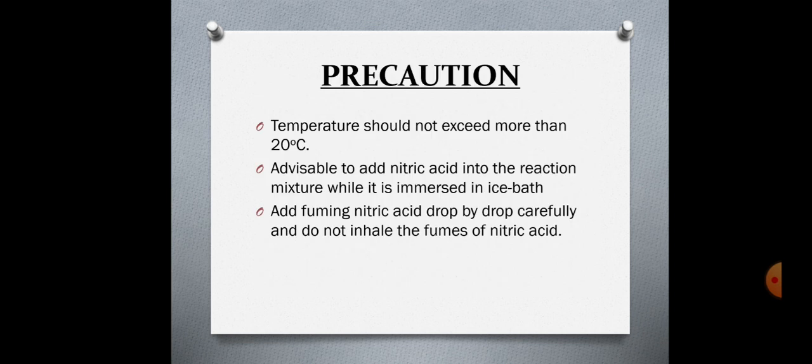The precaution we have to take is that the temperature should not exceed 20 degrees Celsius. It is advisable to add nitric acid to the reaction mixture while it is immersed in an ice bath. Add fuming nitric acid drop by drop carefully and do not inhale the fumes of nitric acid. Otherwise, there will be chances of irritation and you may get a skin disease.